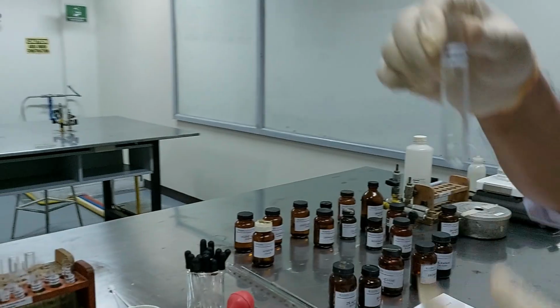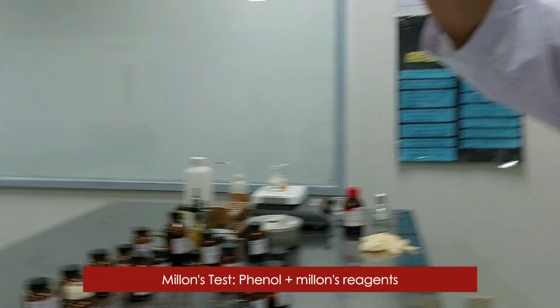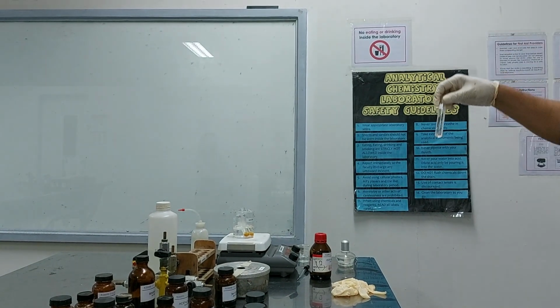Let's go to the second test, Millon's test. Let's see if there is a change in color. We cannot observe the change. Maybe we have to heat this a little bit. Let's see.